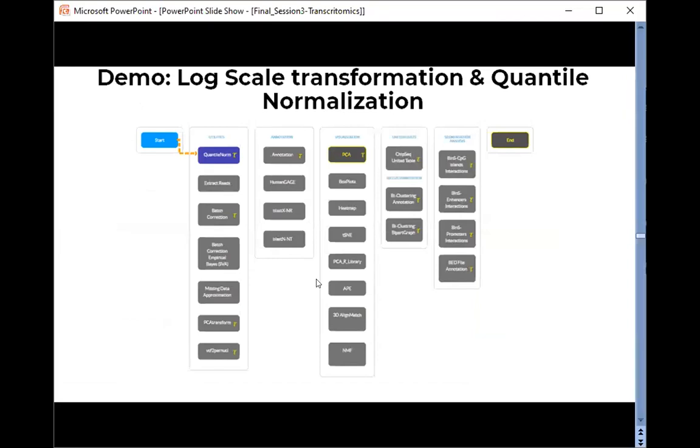So how many of you were able to load your gene expression table, do the log transformation, and produce at least a box plot? The rest of the exercises we can do next time, and you can also explore those yourself.